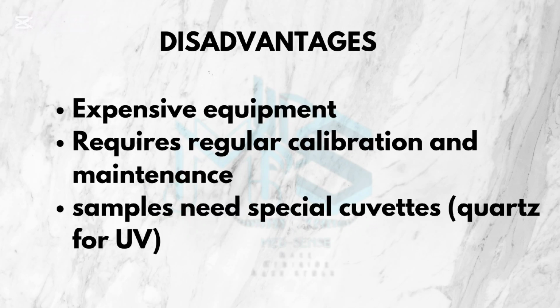For the disadvantages, number one, it's a very expensive equipment. It requires regular calibration and maintenance. When the samples need special cuvettes, it doesn't use the regular.